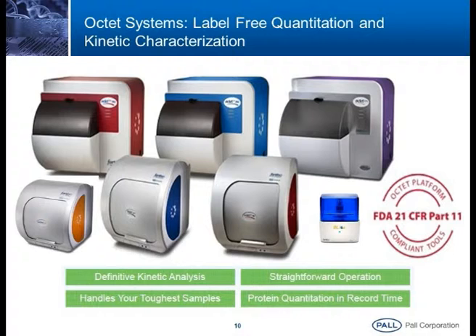These are very high throughput instruments. This one is a 384 well plate format, 16 channel instrument. The sensitivity is similar to the red one, and we can perform quantitation and kinetics at a high throughput level. The blue one, once again, has similar sensitivity but only for proteins, not for small molecules and peptides. This is the high throughput machine. This is also very recently launched. It has 96 channels. So suppose I put in a 96 well plate, in one stretch it will pick up 96 sensors and go to the 96 well plate. You can read a quantitation in 2 minutes. So such a high throughput level.